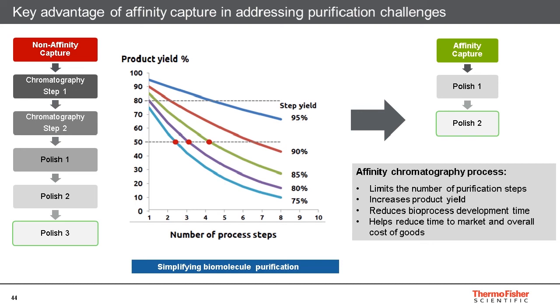Some of you may be working in the area of animal health, where usually the number of steps is much lower, and then you may be interested in identifying the single purification step that will make your process more effective, provided that you would only have envisaged one if you resort to chromatography purification.